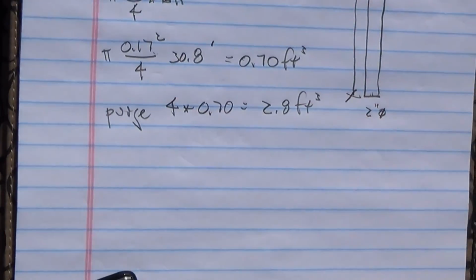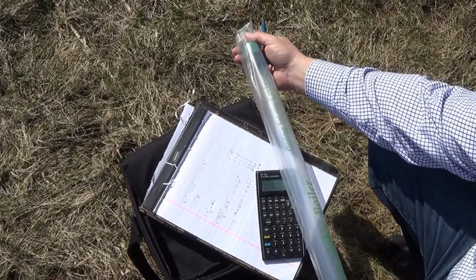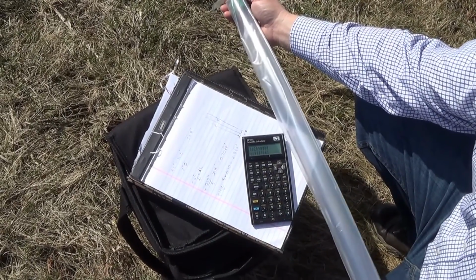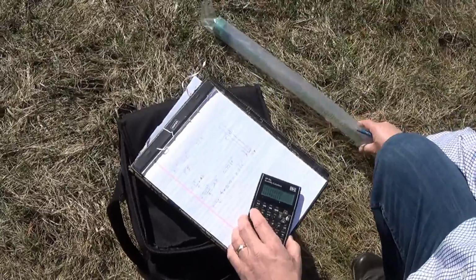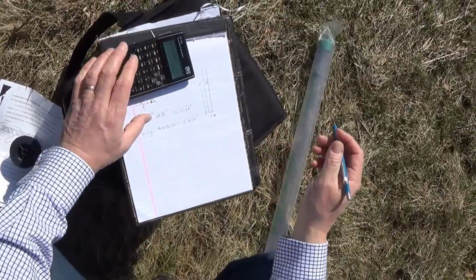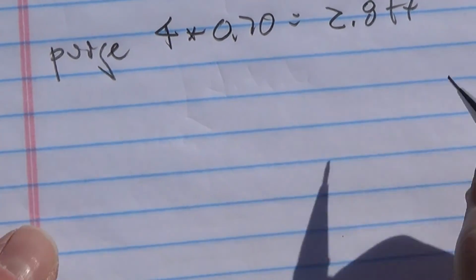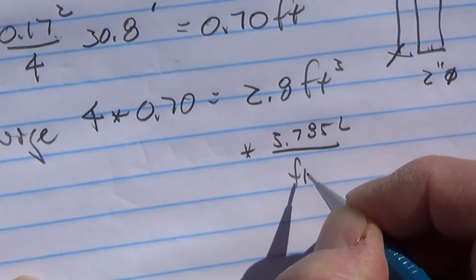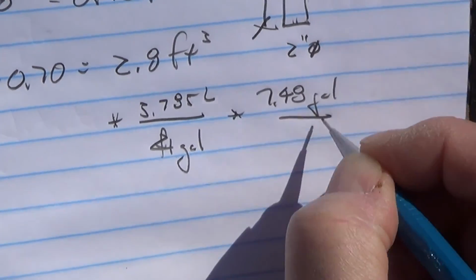Okay. Now with us we have our baler, and I'll show you this a little bit more. This is a sterile baler. You see it's in a plastic tube, so we don't want to introduce anything into the groundwater that we might be sampling. I know this baler has a 1 liter volume. So how many times do we have to bail it? Actually quite a few in this case. But I do know that there's 3.785 liters per gallon. And then I know it's 7.48 gallons per cubic foot.